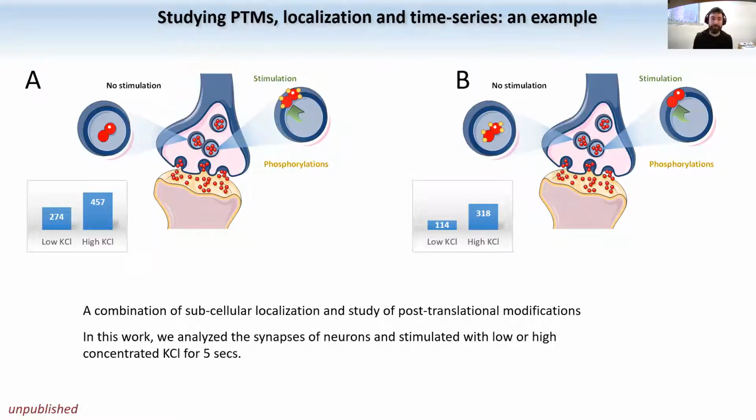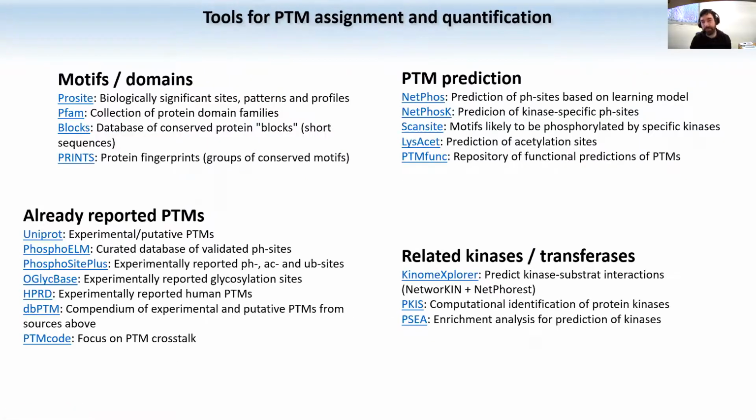So if you put all of these properties together and you group your data based on these different properties, you can even study, for example, which proteins get modified by the stimulus, but also change location, right? These, for example, are very important proteins because they are proteins that are in standby without the stimulation. When you stimulate them, they get phosphorylated, they get on the surface, on the membrane of the vesicles. These are the ones that are recognized by the other synaptosomes in the receptor end. Or the other way around, they can get dephosphorylated and then they are transferred to the membrane. And you can group the proteins based on these properties that you find. That helps you narrow down, okay, what are the proteins that are most likely to be involved during the stimulation in transferring signal. Just an example.